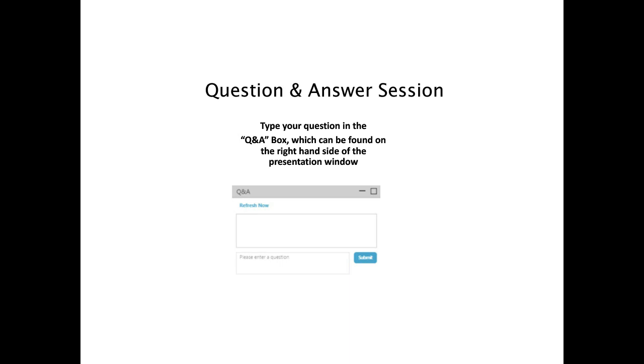Thank you. Here's another. Can the Micro-Dawn Micro-Viscometer Micro-RI detector set be used with standard GPC? Yeah, I think I'll take that one too. So the answer is yes. The difference between the Micro-Viscometer and the standard ViscoStar 3 is that the Micro-Viscometer, because it's typically used with lower flow rates, has a slightly higher shear.